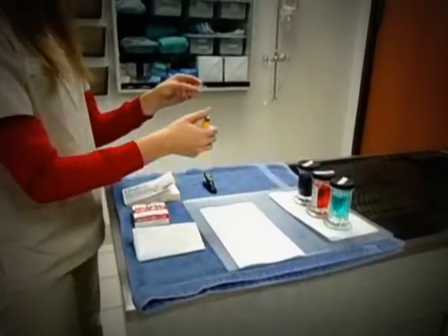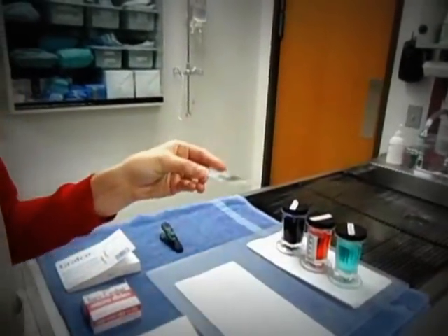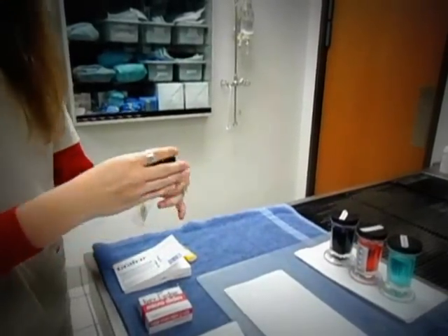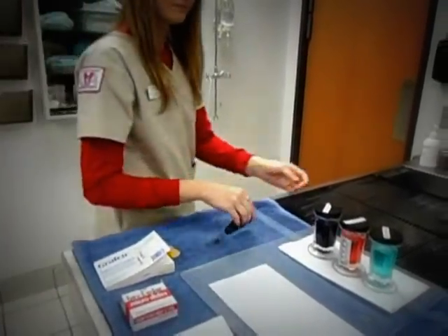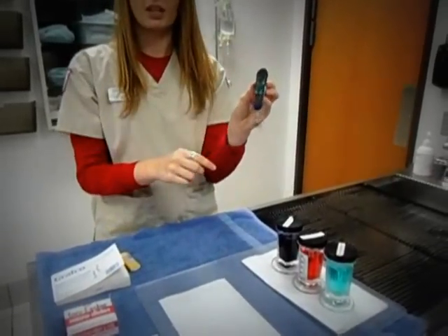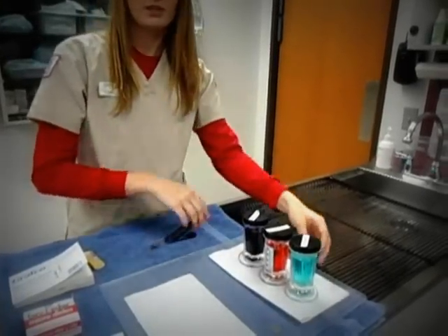I now take my slide and heat fix it. This ensures that all the cells on the slide remain where they are through the staining. I place my clip with the magnet facing up based on which side has the sample on it, and the left ear closest to the clip so I can easily differentiate between the two ears.